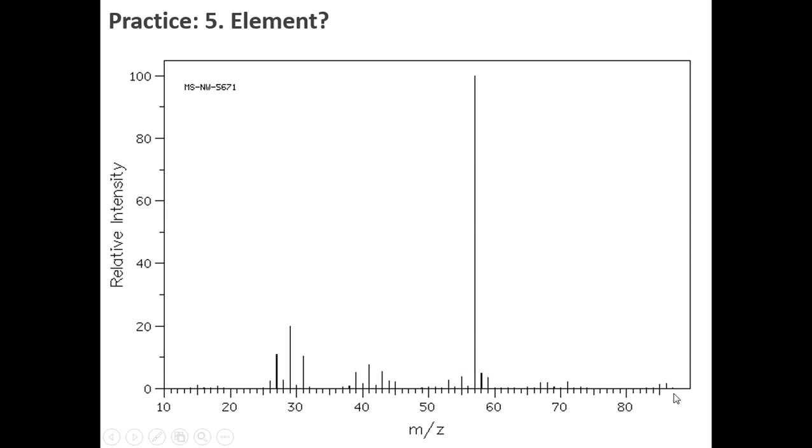And here's something where it looks tricky, because we've got something that looks even, but we know it is not bromine, even though they look like a 1:1 ratio. We know it for 3 reasons. First of all, it is very low. Remember, bromine is 79 and 81, so we haven't even included the carbons here. This molecular mass is just too low for bromine.